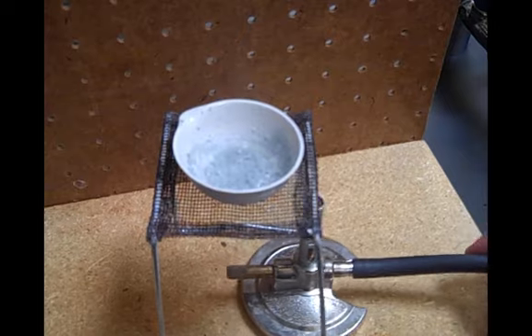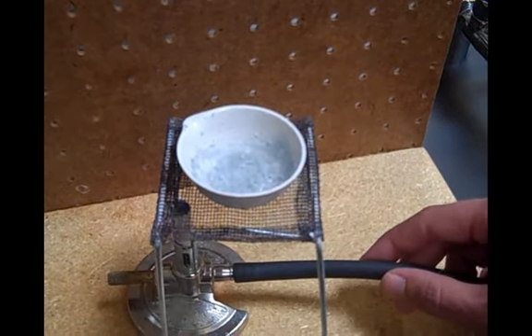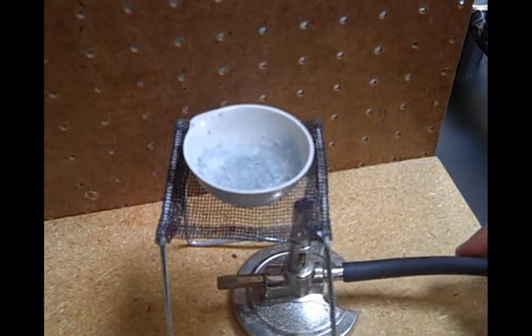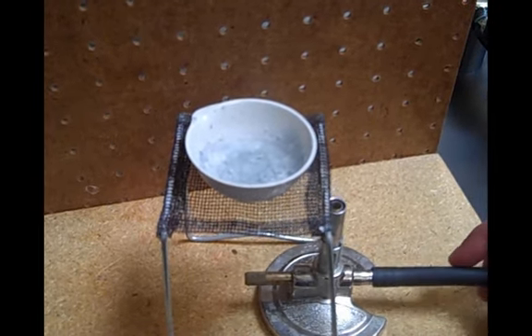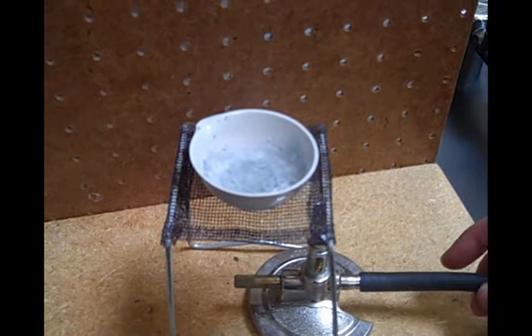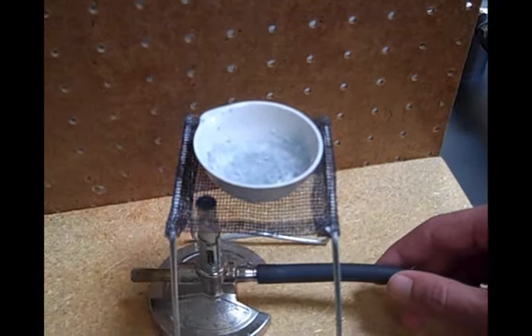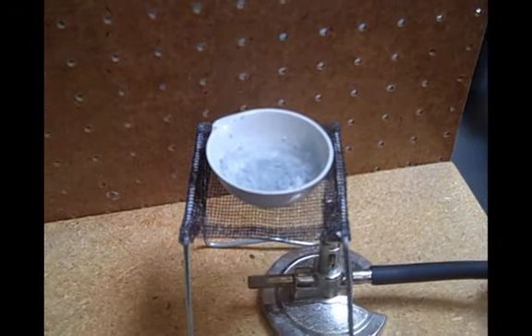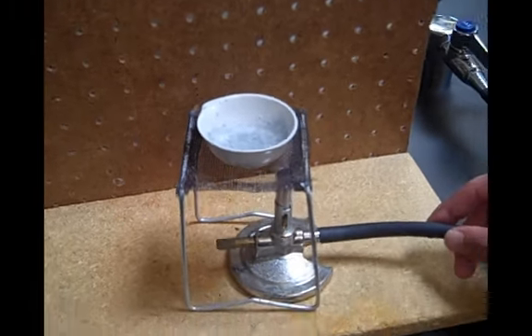Also, we want to make sure that we evaporate all the liquid that we used to dissolve the solid. So I know that all of my liquid is gone when the evaporating dish stops making noise. Eventually, towards the end, it'll start making kind of a hissing noise as the last of the water is evaporating. So I want to wait till it stops hissing, like a cat, to actually stop heating.